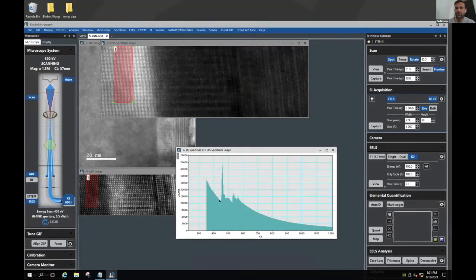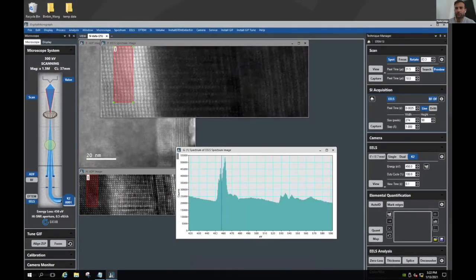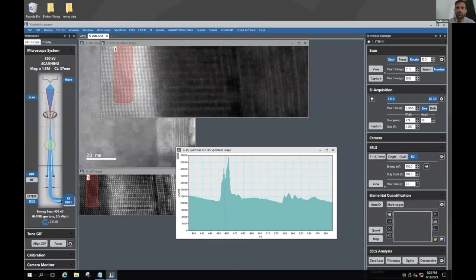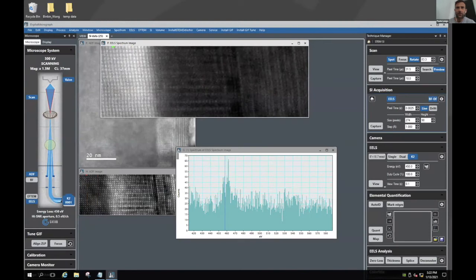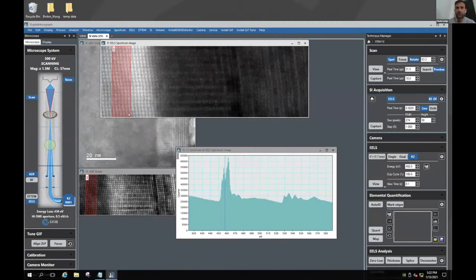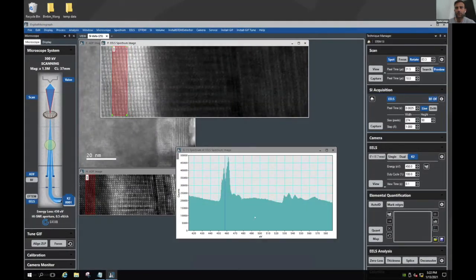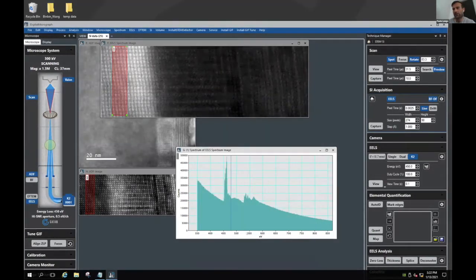Something that is typical of direct detection is that you can start from one single pixel, because, as I was telling you before, you're only limited by shot noise. This is only one single spectrum, but as soon as you start summing a bunch of spectra, look how the quality increases. This is because we're only limited by shot noise, for the most part.